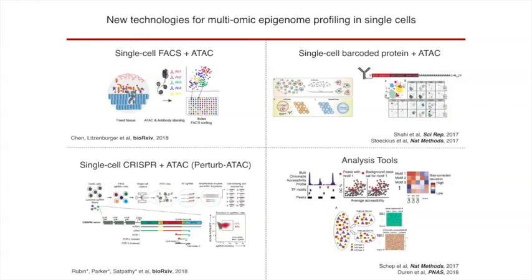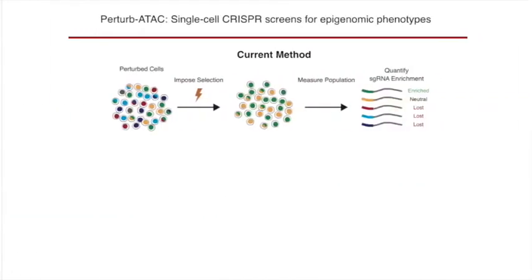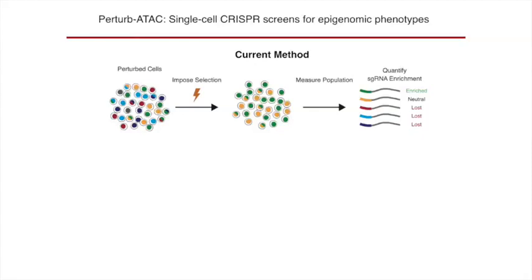And our view is that it's nice to have the epigenomic information to really understand the cell state, but we really want to connect it with what everybody else is studying using cell surface proteins or targeted RNA expression. So just in the last two slides, I'll show you an example of some of these up-and-coming technologies. I'll focus on this paired CRISPR screening with ATAC-seq, but you can imagine the same type of analysis for AbSeq paired with ATAC-seq, right?